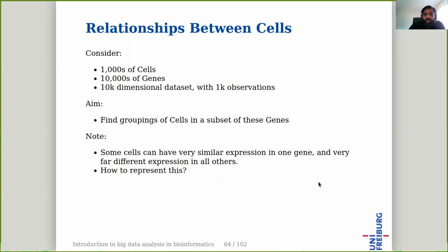As we already saw in the introduction slide for single cell sequencing, some cells have similar expression patterns, but some have very distinct expression patterns. We use such information from the genes that share different or distinct expression patterns, these highly variable genes, to cluster or group these cells.